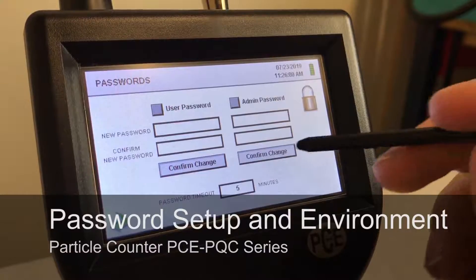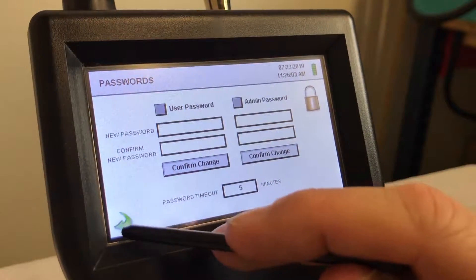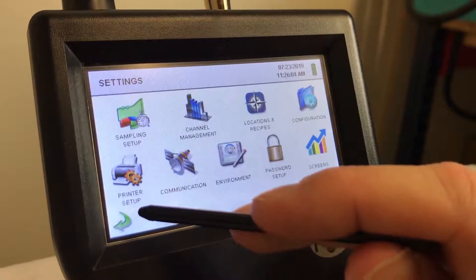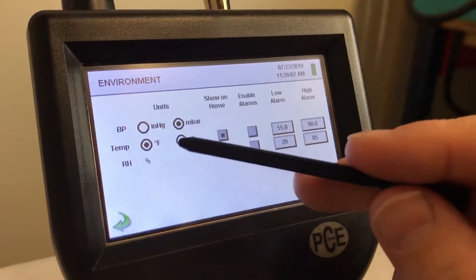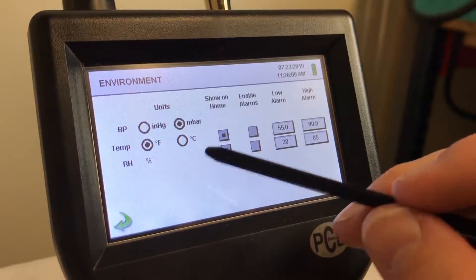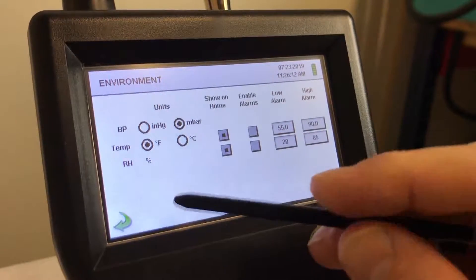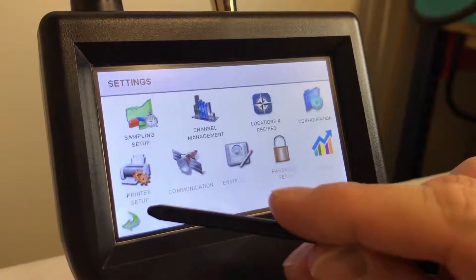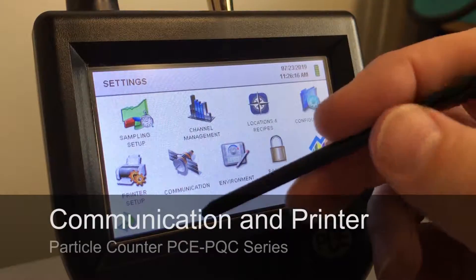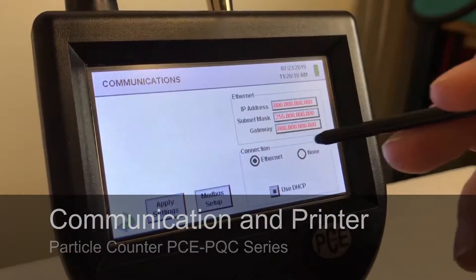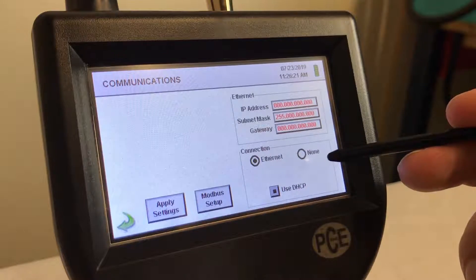Password setup is self-explanatory. Environment — if you want to change from Fahrenheit to Celsius or change your alarm settings, you can do that here. Communication — you can do wirelessly or through the ethernet connection.